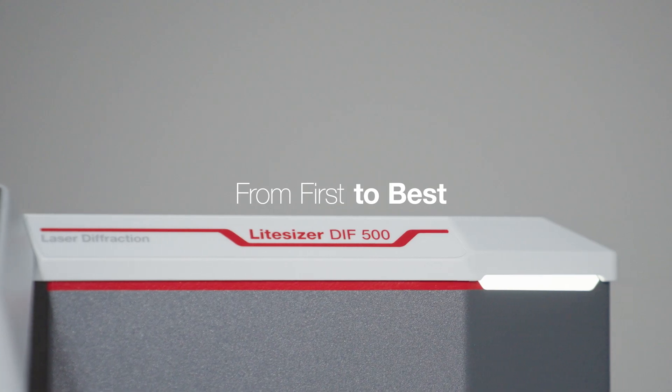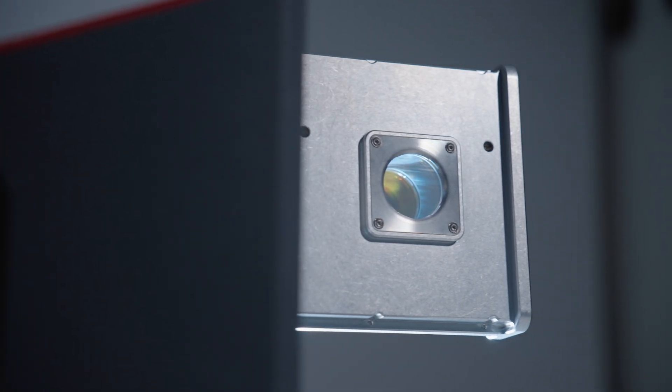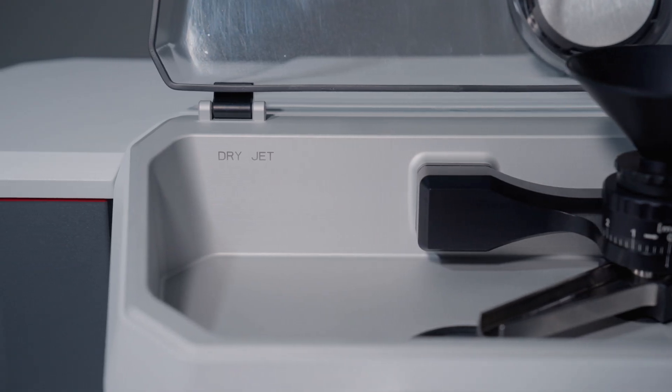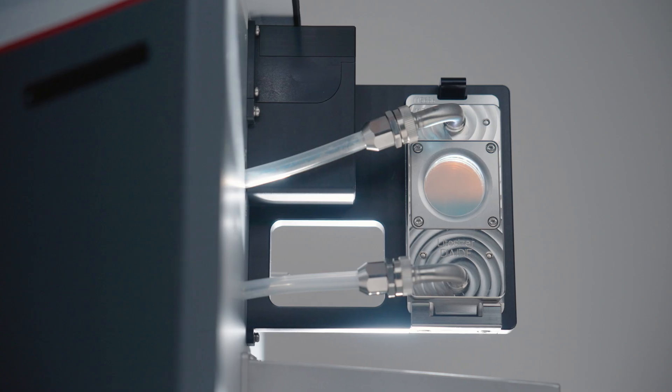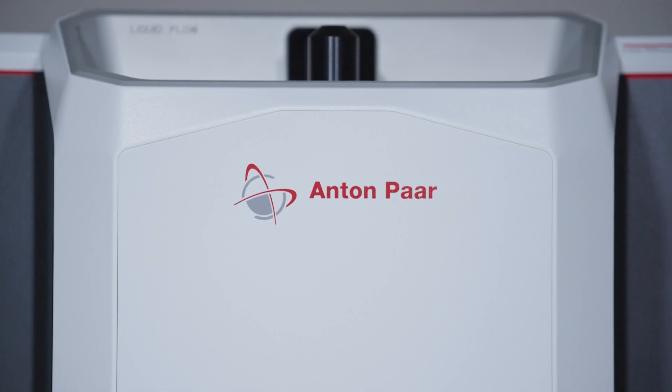Almost 60 years of laser diffraction expertise drive this tried and tested particle sizer. A new, more sophisticated instrument that delivers even better results. Litesizer DIF, with a range from 0.01 micrometers to 3.5 millimeters.